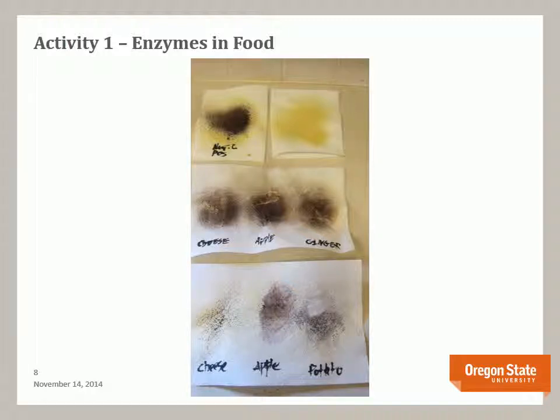These are the results I got when I did this experiment twice. On the top is the positive and negative control, as they called it. I disagreed with the terminology of positive and negative controls in this experiment. Their positive control was starch that was then sprayed with indicator, and the negative control was a paper towel that didn't have starch. Well, the paper towel that didn't have starch was a good negative control. An even better positive control would have been starch sprayed onto a paper towel, then treated with a purified form of amylase to see what our true positive result would be.